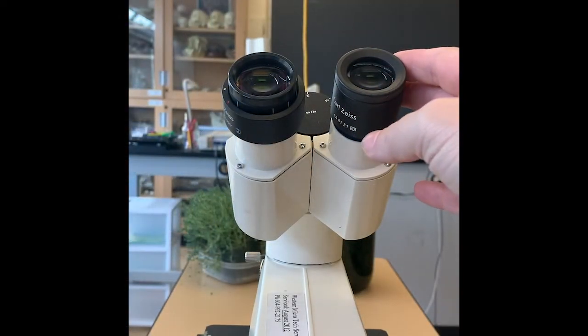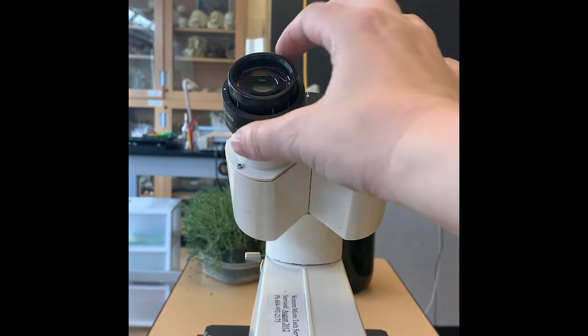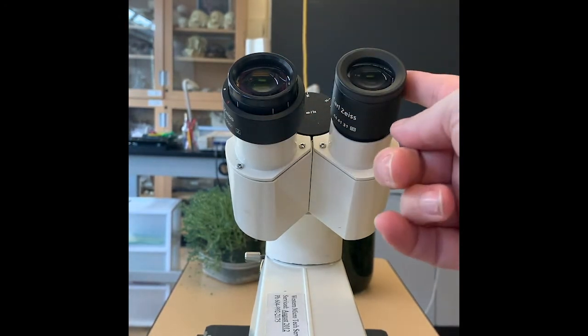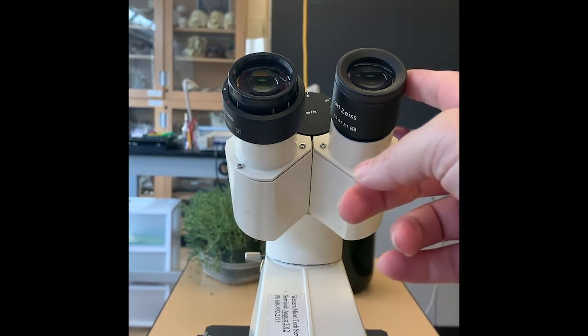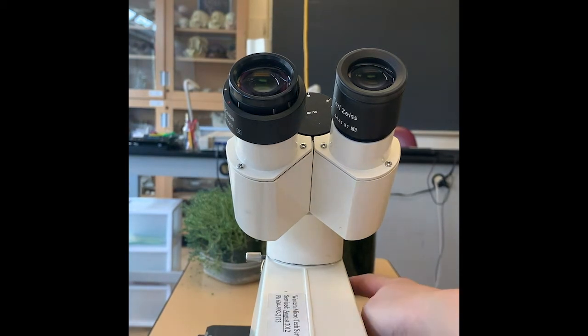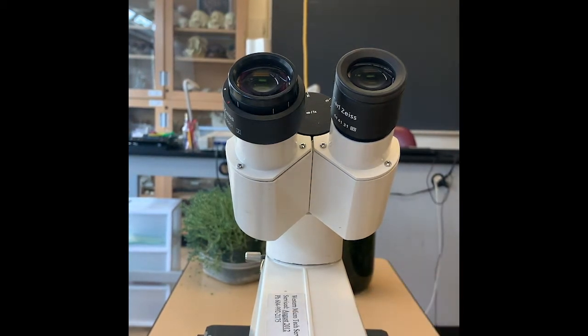Here we have the ocular lenses. This is the part that you look through when you're looking at your specimen. These lenses give you an additional 10x magnification. This is why the magnification shown on our objective lenses is actually 10x the value we see there.